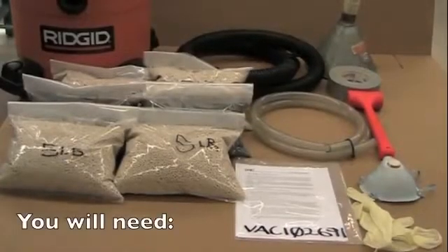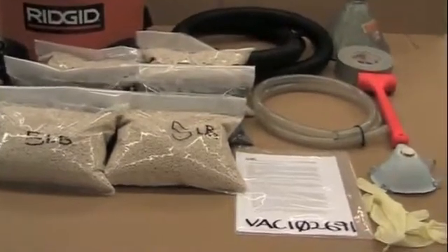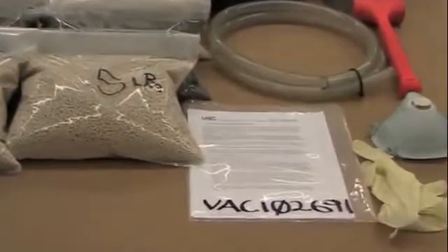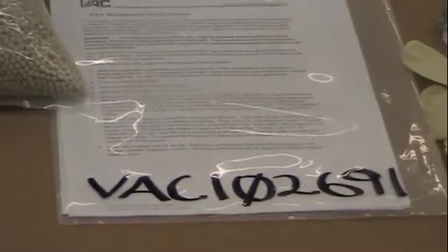You will need a wet and dry shop vacuum cleaner, a 1-inch diameter hose, a funnel, a dead blow, duct tape, dust mask and rubber gloves, and Vacuum Atmospheres Purifier Charge Part Number VAC102691.